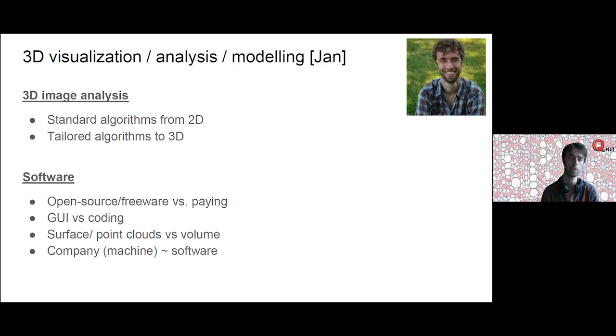Then secondly, something that has indeed been mentioned by Tom as well, when it comes to software, there are many flavors. You have to consider whether you want to go for open source or freeware, or you have some budget available, whether you want to have a graphical user interface, or you're doing everything command-line based. Certainly the paid versions, I'll show some options, not only have a GUI, but they often also offer some kind of scripting engine where you can write your own scripts, or even a full binding to Python.